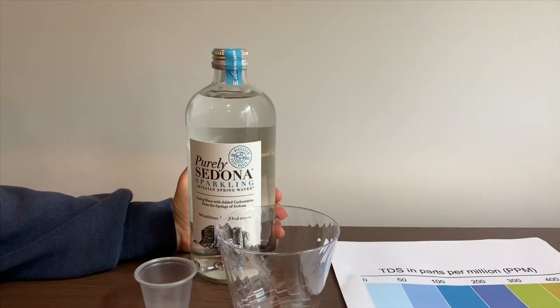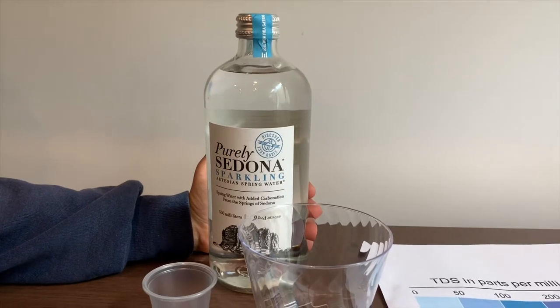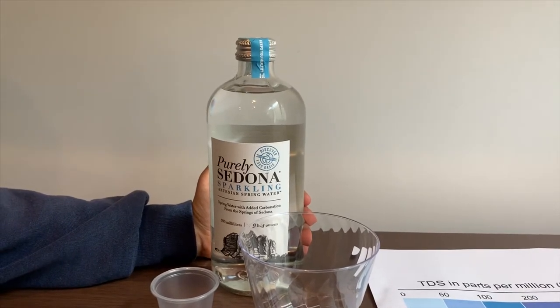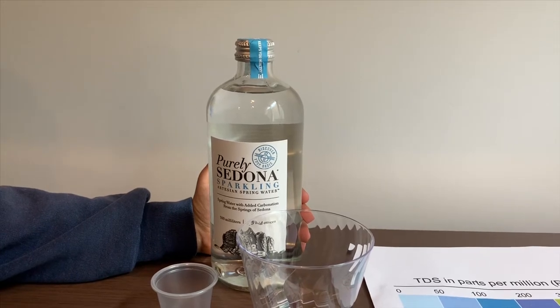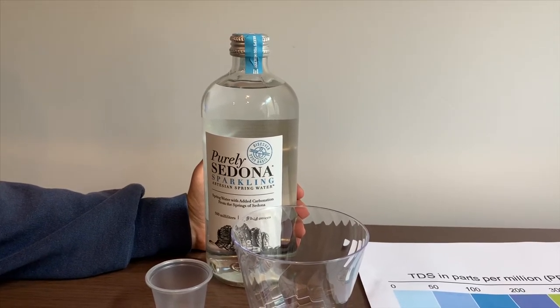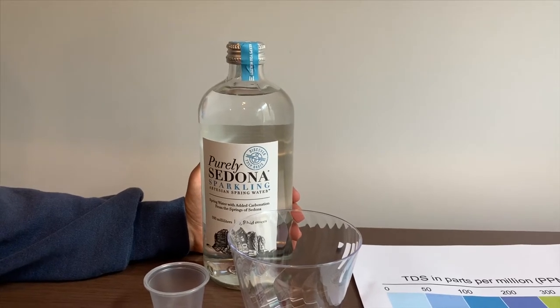This is Purely Sedona Sparkling Artesian Spring Water. It's sourced from Sedona Springs in Arizona. Remember we tested the still version of this? Its pH was 8 plus and its TDS was 135. Let's see how this compares.